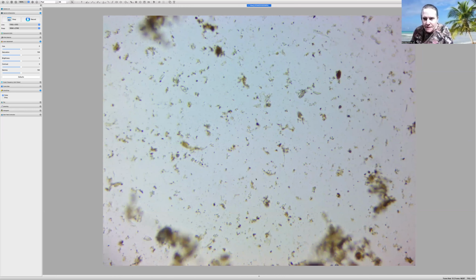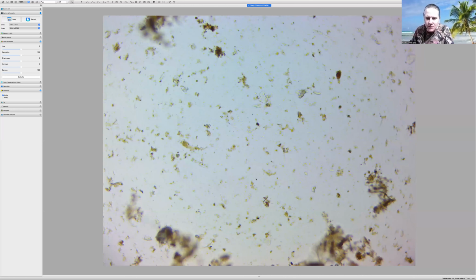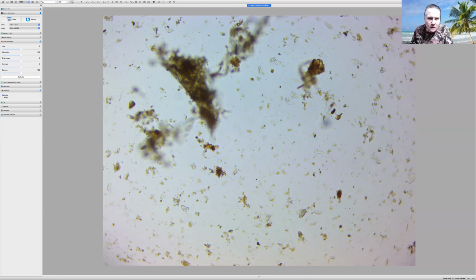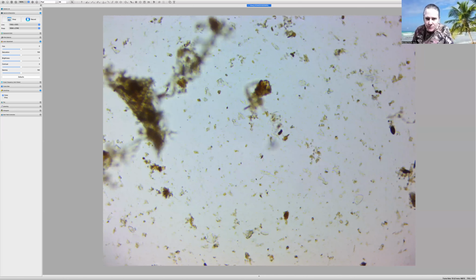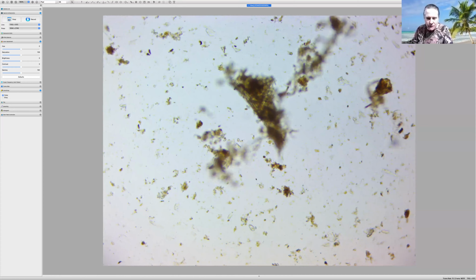But let's focus that guy. He looks huge. Yep, he's a ciliate. Zooming around over here, bottom right corner. I bet we can find one in this aggregate somewhere. Okay, I see a lot of motion coming out of the aggregate. I'm sure you would be able to find that too. And try to center it. Now I'm going to zoom in. We'll see what we can find.